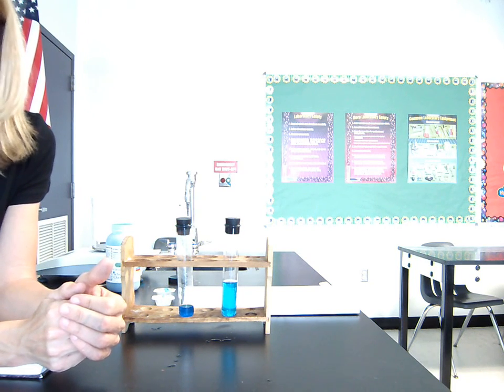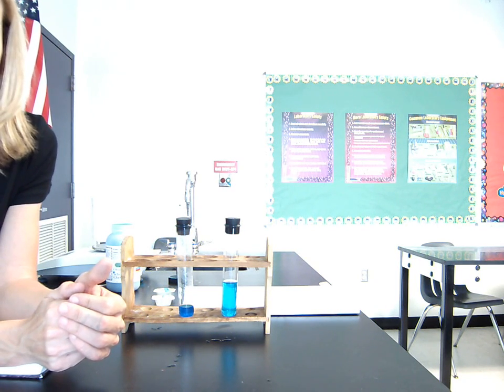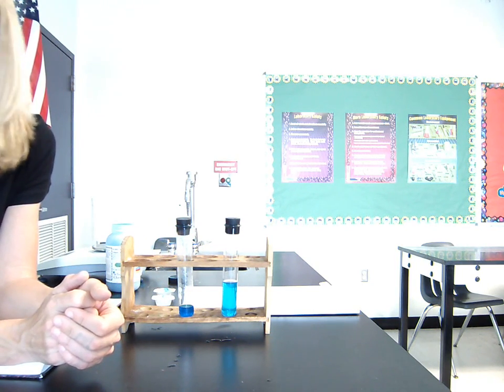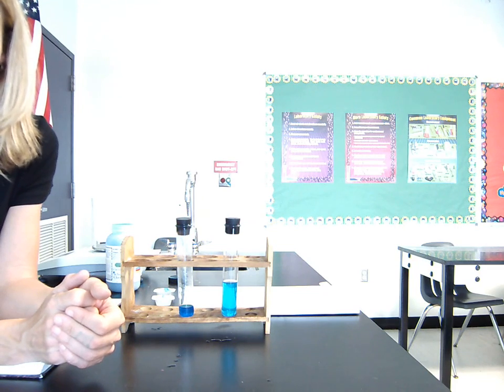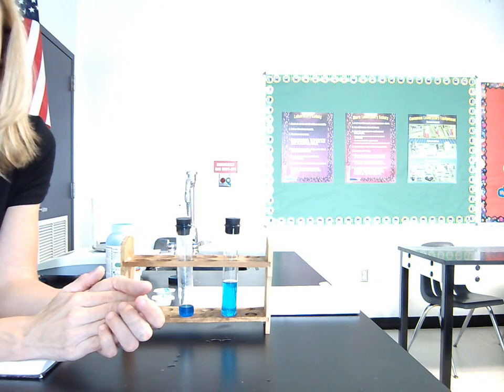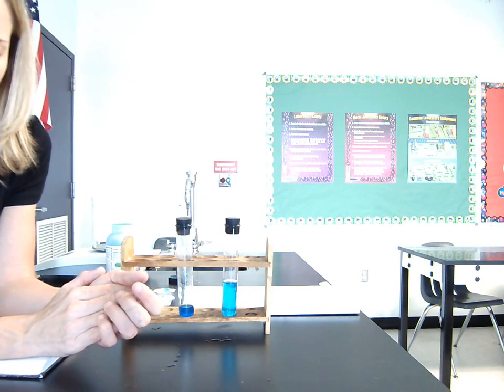There's no other way for us to tell if it's saturated other than by being able to see it physically. If you can't see it, then you're not going to be able to say one way or the other if it's saturated. So by being able to see leftover solid in the bottom that will not dissolve, that's how you know it's a saturated solution.